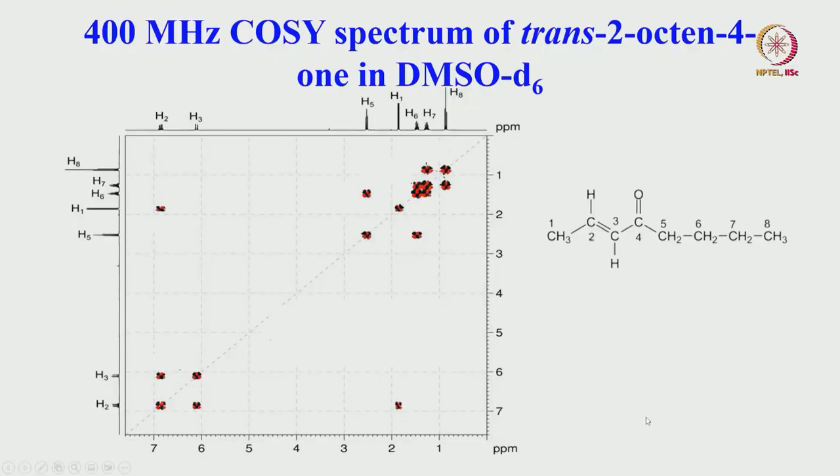With that, we'll continue further today. We'll take a few more examples of NOESY, how 2D NOE can be utilized to get the structure or conformation of molecules, from simple to slightly complex molecules. That is important, because basically in this course I want to tell you how we can analyze the spectrum, and how we can use the different NMR techniques, 1D and 2D, to get structural information for your molecule. Okay, we'll start with another molecule today.